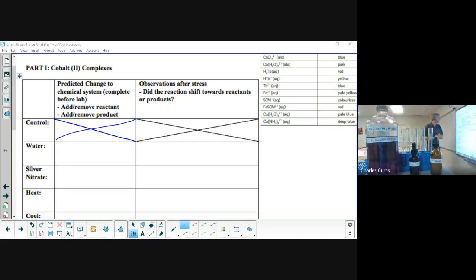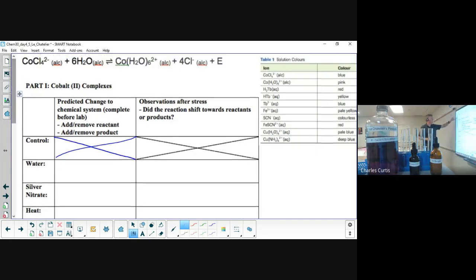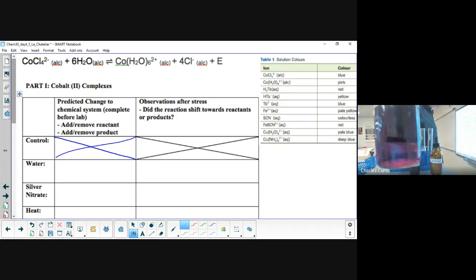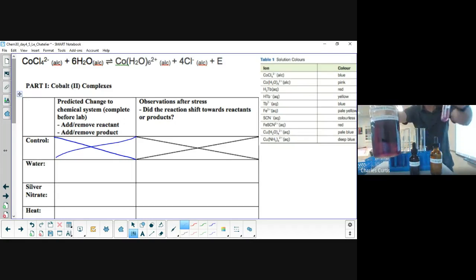Okay, so the first part of our lab is going to be the reaction at the top. So we have cobalt chloride equilibrium mixture. So that's this big purplish bottle. Now I have gone and put a bit of this equilibrium mixture in 5 test tubes.